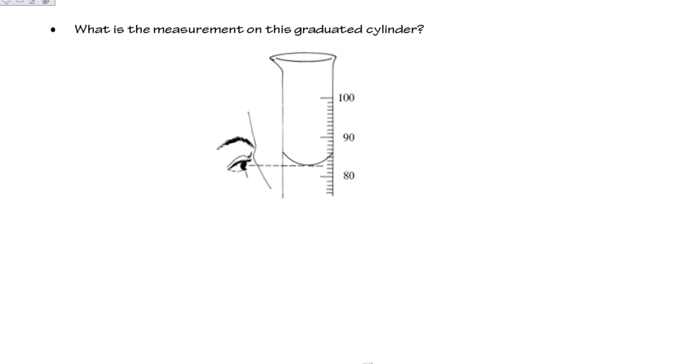So I take a little peek here, and I've got 80 milliliters, 90. This must be marked off every 1 milliliter. So I'd have 80, 81, 82, 83, 84, 85, and so on. I want to measure to that bottom of the meniscus. So I might be able to say, for sure this hits 80 milliliters. For sure 81. For sure 82. That right there must be about 82. Oh man, I don't know about the 83. I think it might be a little bit less. So I know for sure it hits 82 milliliters. And that's the best I can do using the markings on this graduated cylinder.